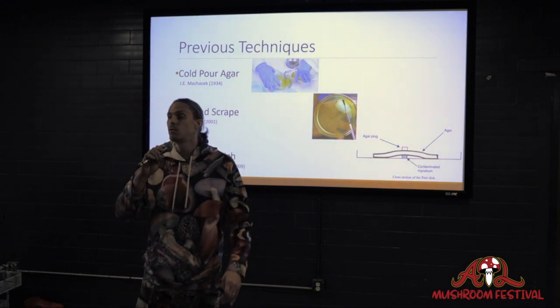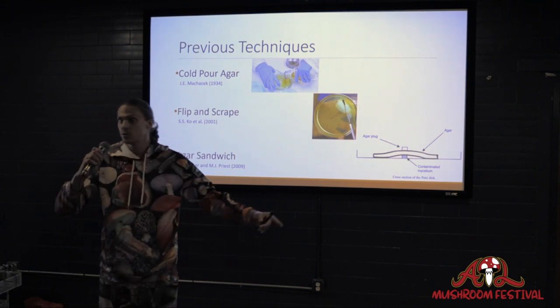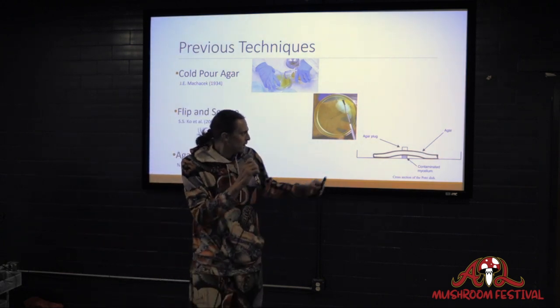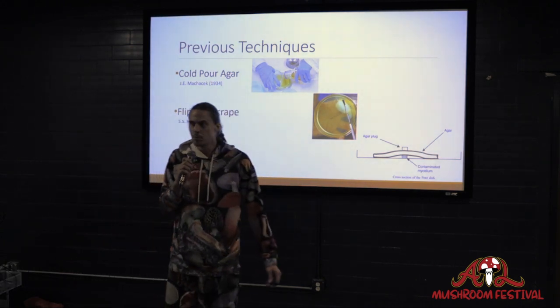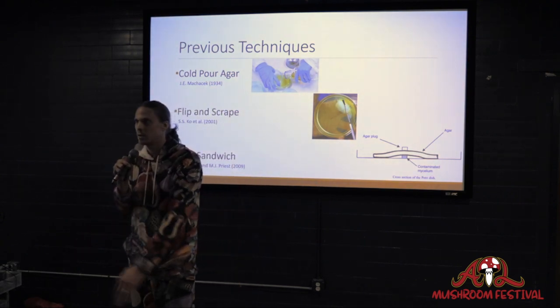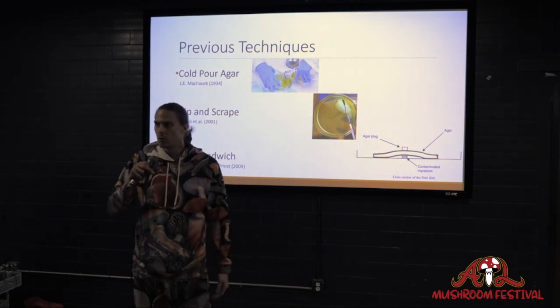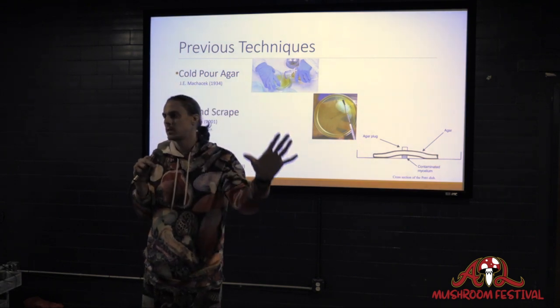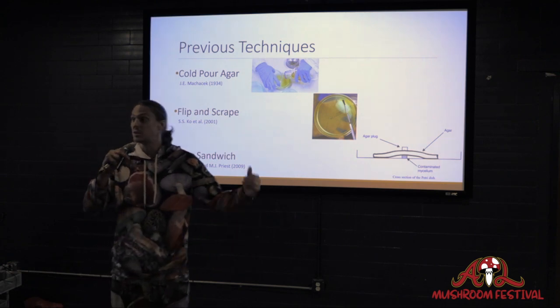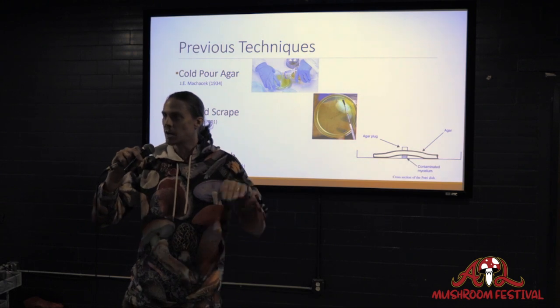The bacteria has no form of locomotion, generally. Some bacteria have a flagella, kind of like a tail, that allows them to wiggle through, but most bacteria don't. And so they depend on you picking it up and putting it there, right? Whether that's with your tool or with your breath or with your hands, or through some other source of contamination, you have to pick up that bacteria and place it there, or it just hitchhikes a ride with the mycelia and rides over the top of the plate.